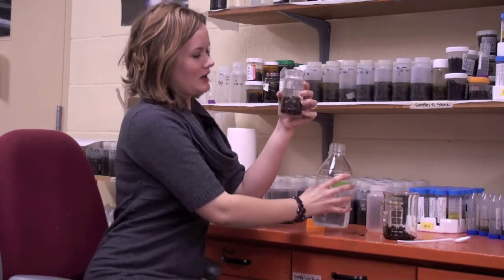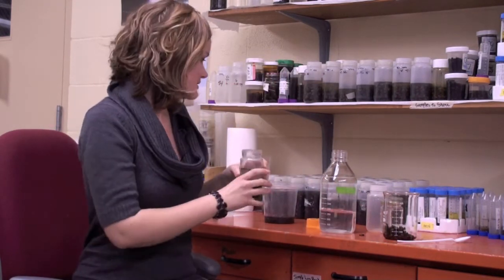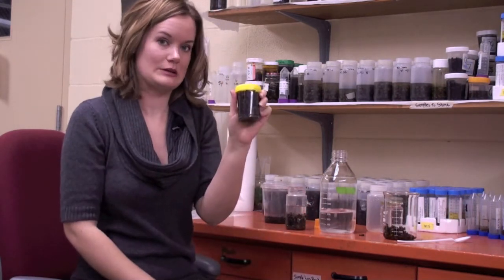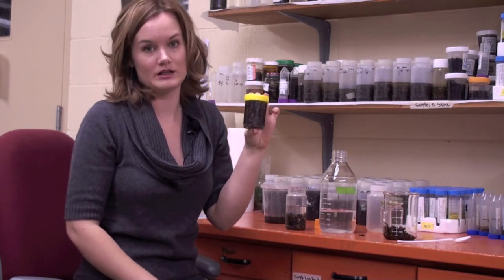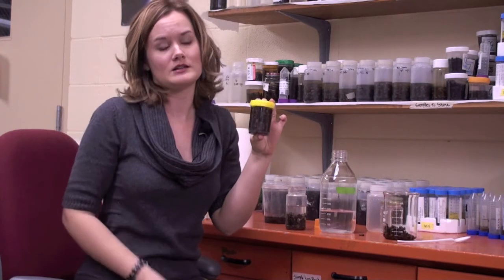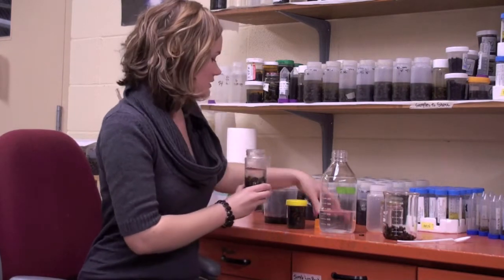Now I need it covering about 1 inch across the line of bees, because if it's sent to me like this, for example, and the bees are completely up to the top, they've soaked up all of the alcohol, and in this cup in particular, there's hardly any alcohol in it. And if the bees soak up all the alcohol, then the bees are rotten, and your data will not be quite as accurate. So it's really important, as I said, to have it filled like that.